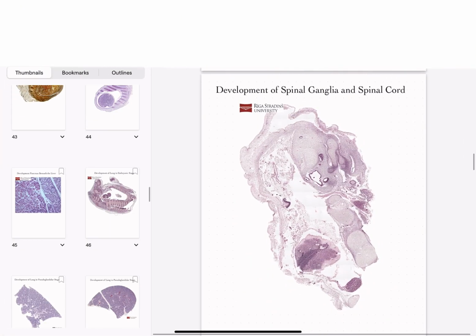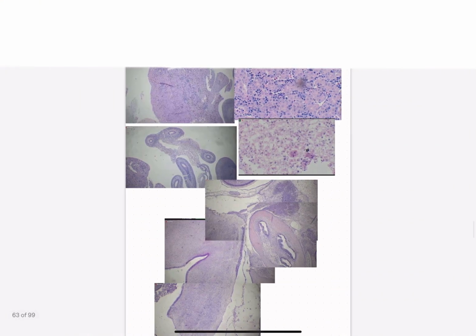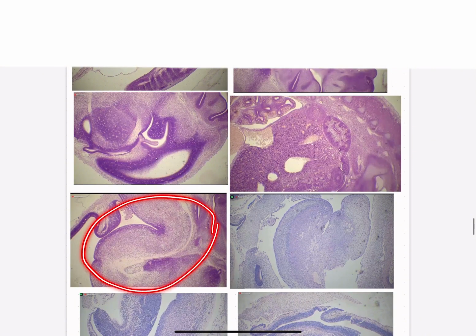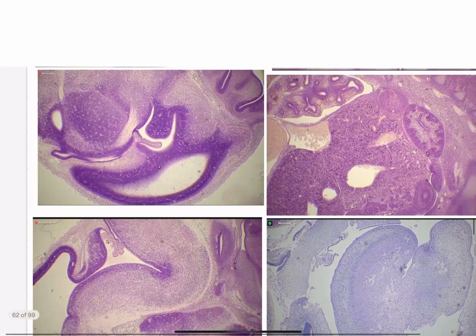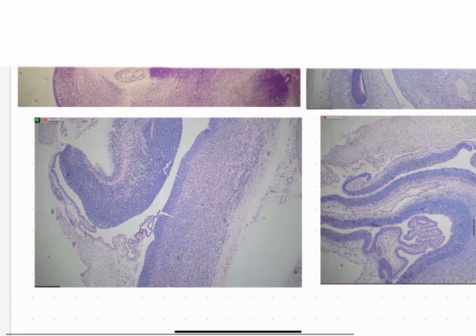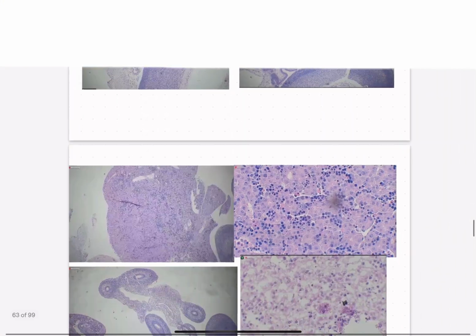If we look at the demo lab slides of it instead, here we go. Here we do have, this is part of the brain, and we can see that we have the plexus choroideus right there. Again, a very wiggly structure. I'm repeating myself with the adjective I'm using to describe it, but I think it makes most sense like that. Here we have it again, and then there, that would be the plexus choroideus, I would say.